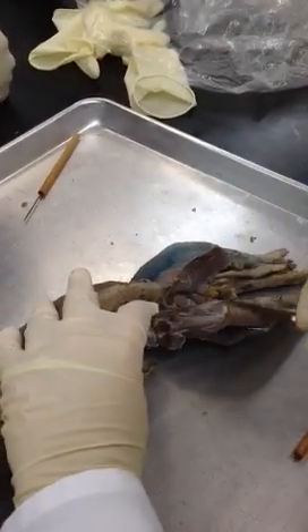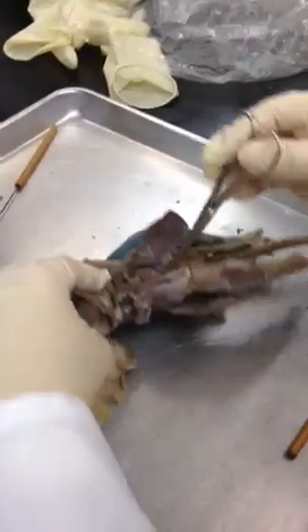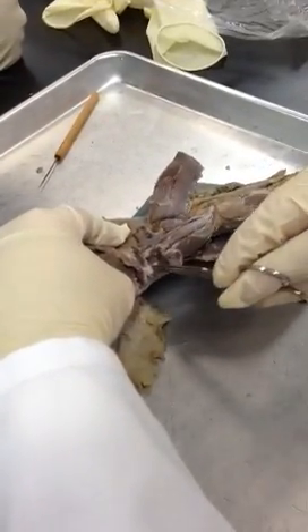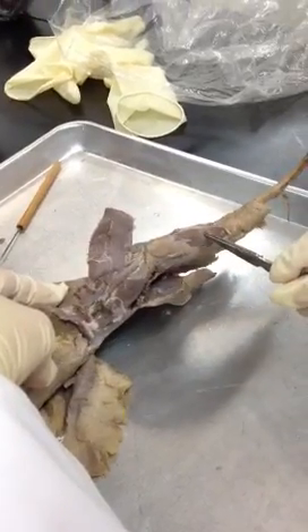Laterally, we have vastus medialis, rectus femoris, vastus lateralis. And right in here is tensor fasciae latae. On the front of the mink's leg, here would be tibialis anterior.